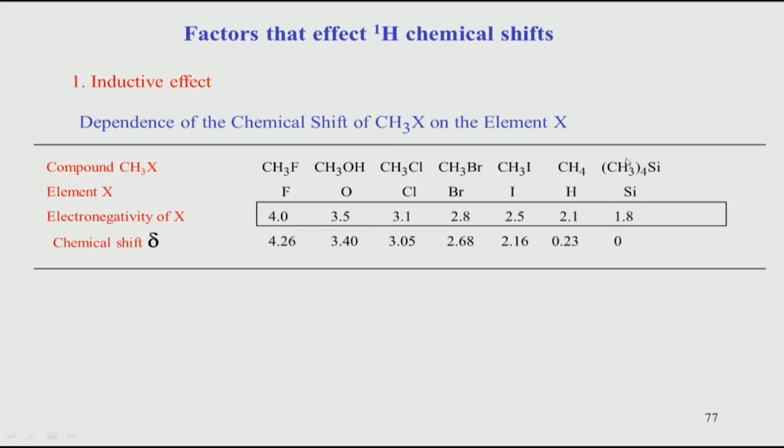We saw in the previous class how we actually calculate chemical shift values. Typically, we take a reference molecule, which can be any molecule of our choice. Typically a standard is used which is agreed upon by everyone, an IUPAC standard, and that is tetramethylsilane. We use the abbreviation TMS.